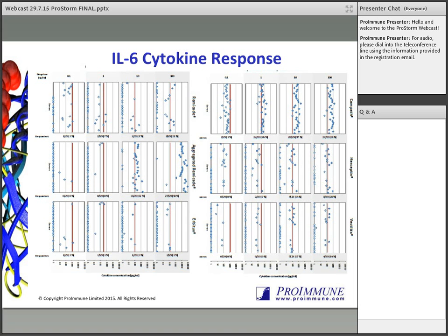On to the other 2 test articles, Herceptin and Vectibix, which were on the bottom right. There's a very observable dose response seen for Herceptin with 0, 7, 14, and then 28% of donors responding or producing IL-6 in response to Herceptin, while Vectibix just had responding donors of around 17 and 14% at the 2 highest doses.